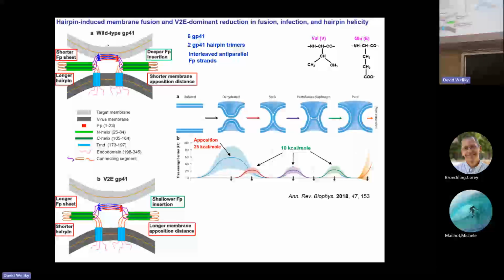Yes, and how much I think is important when you compare the samples. We have the vesicles, then we add the protein, and then they bind. Centrifugation, yes. And so why can't you just do the experiment if it's not taken up?